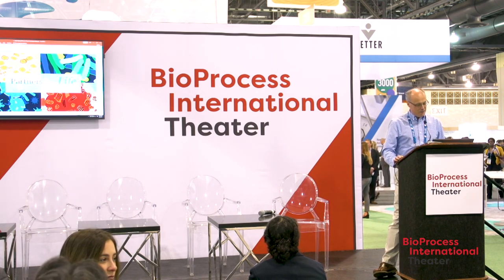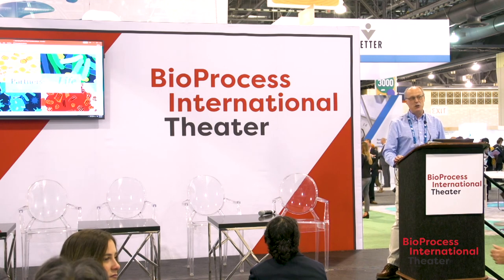Yeah, so I think in-process testing is interesting for some of these things. Usually, again, because you've made such a small amount of product compared to the amount of similar contaminants that you've also got at that point. Fortunately, for lots of the gene therapy vectors, the AAVs, for instance, there's an early affinity capture step which gets rid of a lot of the rubbish. So actually you can be a bit more confident that you're tracking what you think you're tracking. But otherwise it is a challenge to make certain that that little tiny peak was the one you're interested in and not that great big one next to it. And of course we try to look at ratios of A280 versus A260 and things like that to try to identify which peak's which, but it's not straightforward.